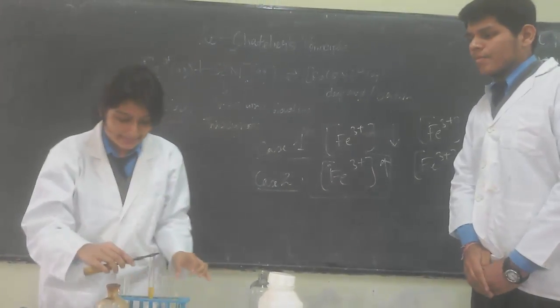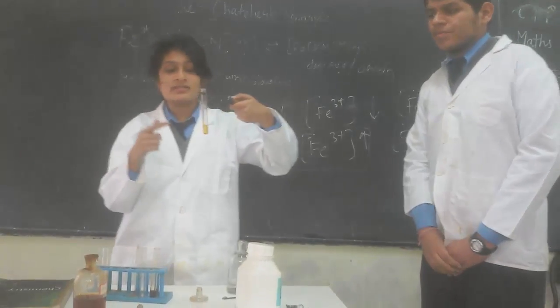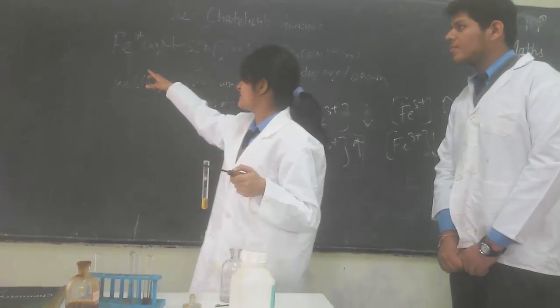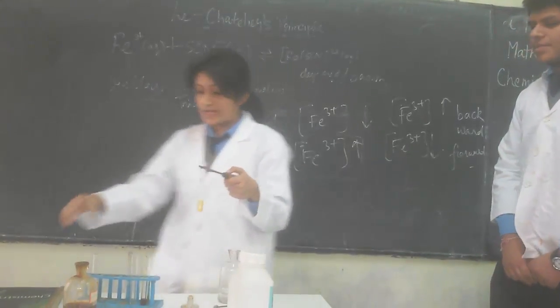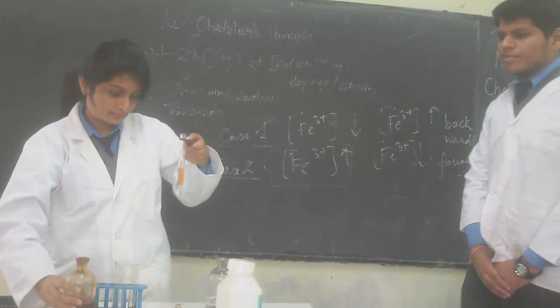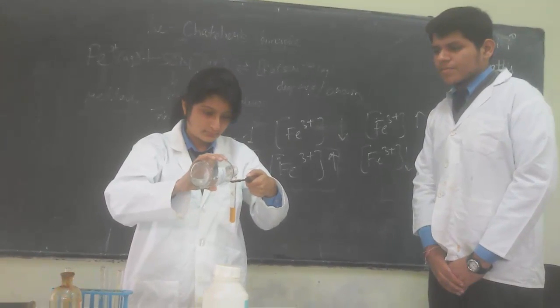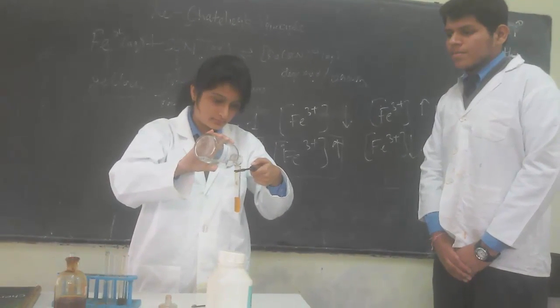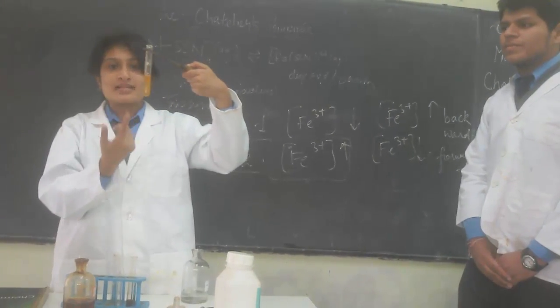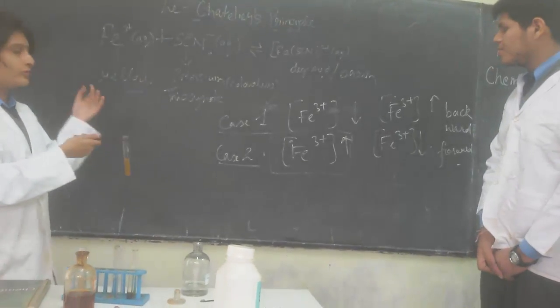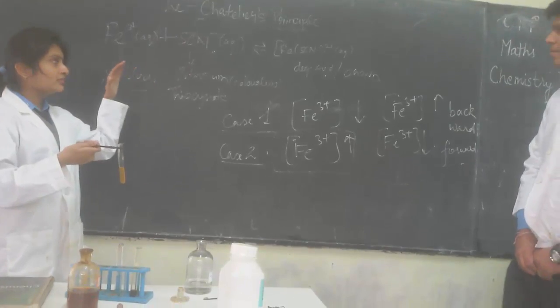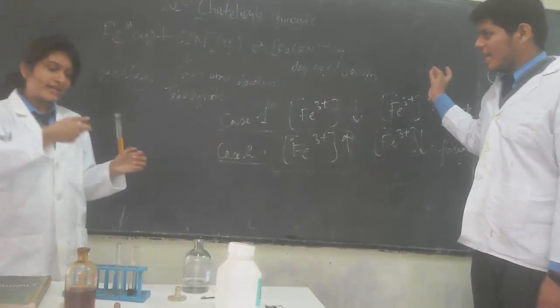Now the second case. You can see the intensity of the red color starts coming again. This is because according to Le Chatelier's Principle, when reactants are increasing then the reaction will go in the forward direction.